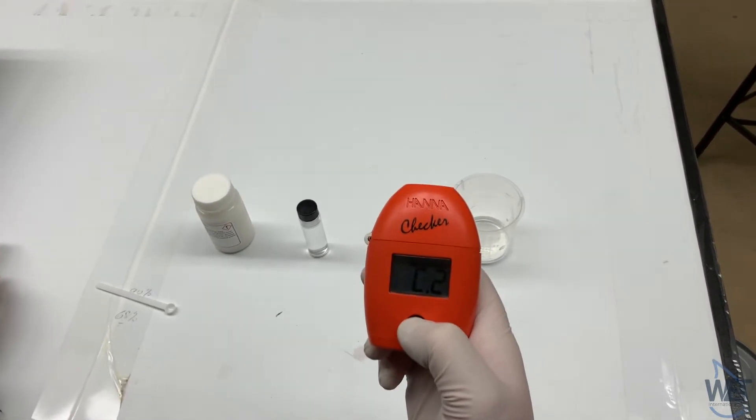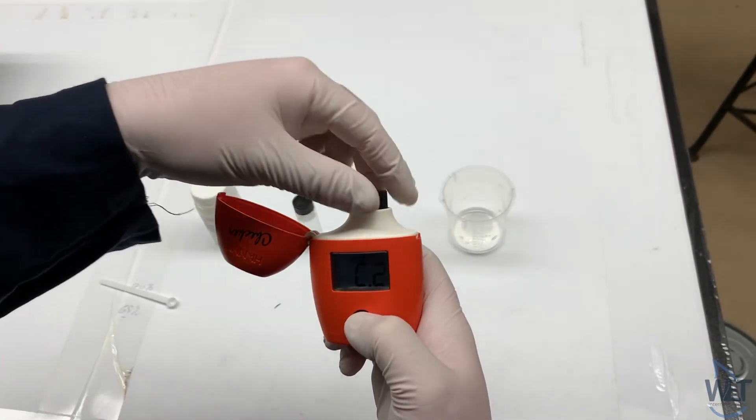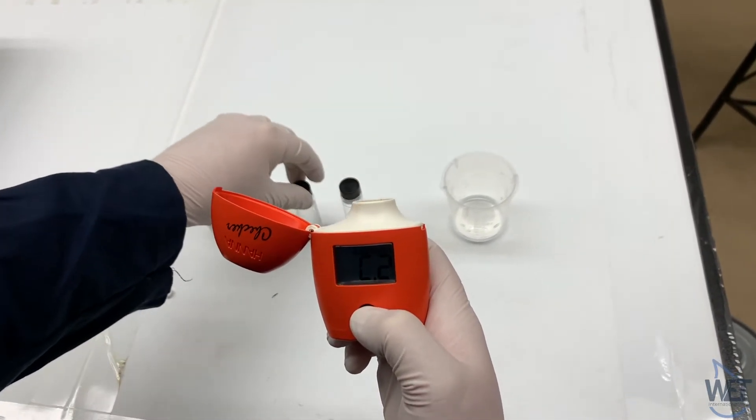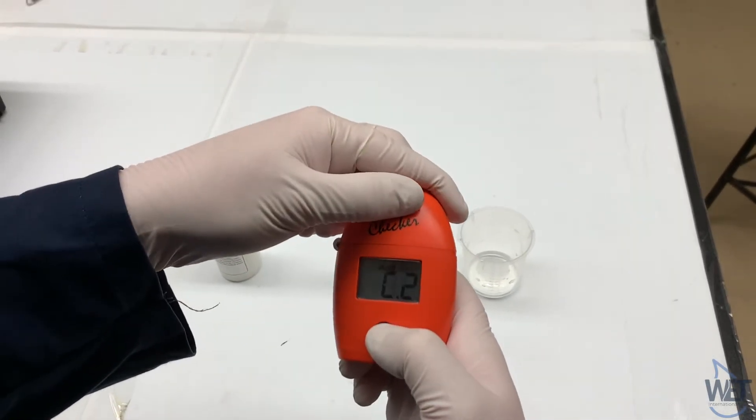When C2 comes up, you'll know that the colorimeter is zeroed out. You can then insert your sample and press the black button to take a reading.